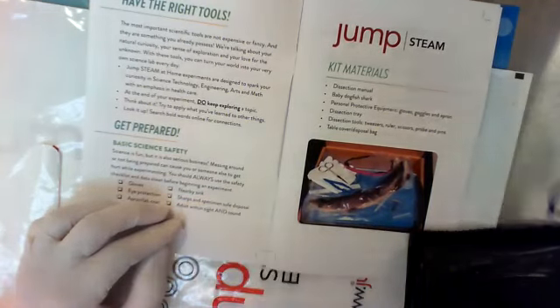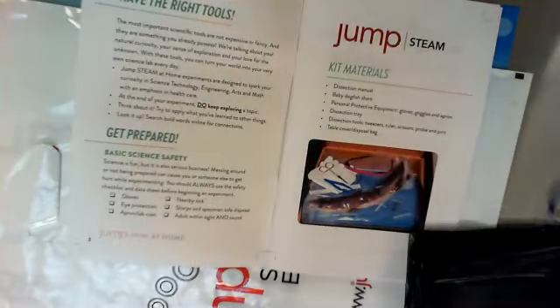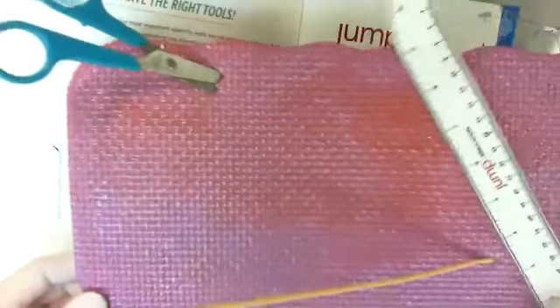The sharps themselves, when you get it out, you'll have 3 sharps. So you should have a, oh no, my board's gone. I put my board in the bag and forgot it. Think. So you should have a set like this.